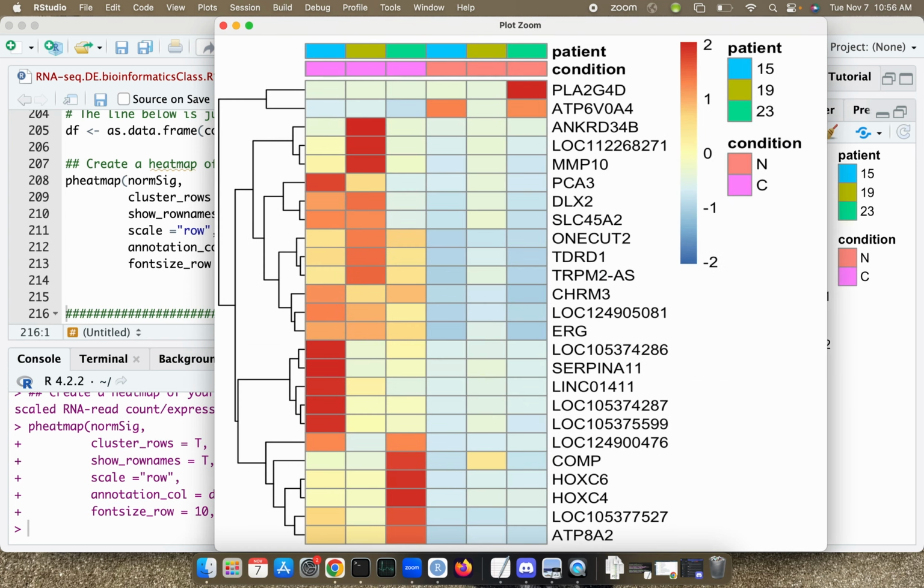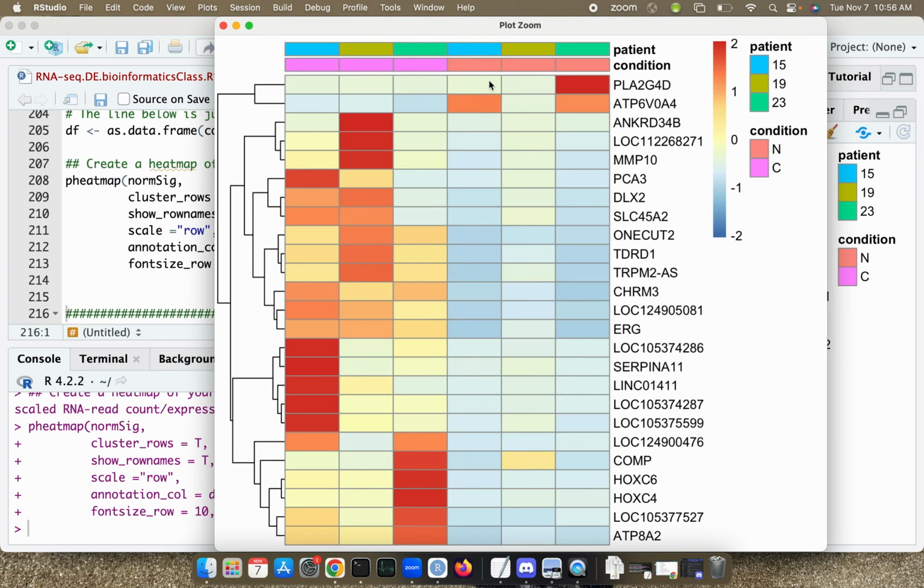Oops. And it's kind of interesting, we should see more consistency between the samples, to be honest. It's a little concerning we don't. That is involved in the quality assessment of our data, which we didn't really spend time on here, but I'll share a link about that quality assessment in the video notes and also on Discord. So these are showing very differentially expressed genes, and they're looking not very consistent between samples within the same condition, which, like I said, is concerning, but we're still going to go with that. So you could pick out some of these genes and talk about them as well.